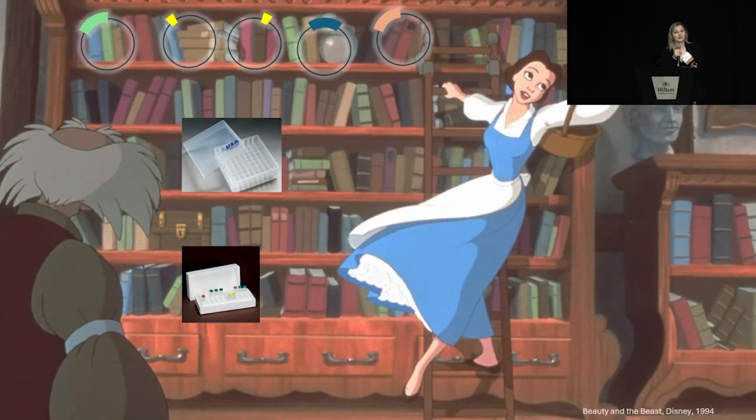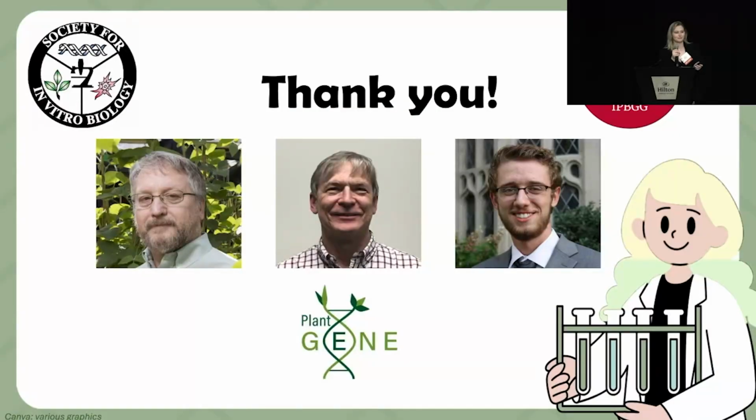So by the end of this, you'll have not just your level 0 plasmid library, but also your freeze stock library and your primer library as well, that everyone will be able to access and hopefully makes cloning a little bit easier in your lab.